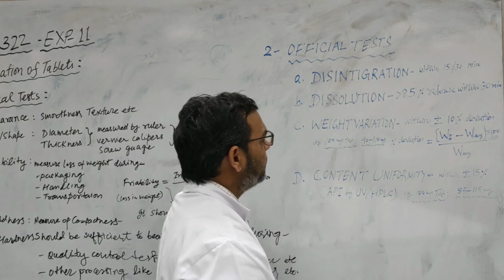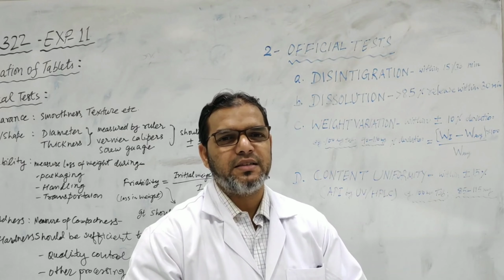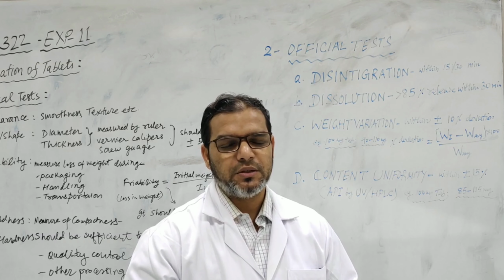Dissolution is a process of measurement of the release of the material from the tablet. So it is a kind of rate process. You put your tablet in the dissolution machine and you measure how the drug is releasing with time. So you make a kind of time and concentration profile of your tablet, and it is actually a kind of measure of absorption, or a kind of performance evaluation.